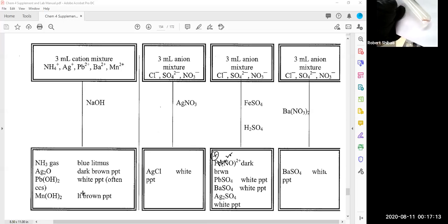Do you see it? Look at the interface between the sulfuric acid and the green solution, or above it. At that interface, there's a layer. Do you see the brown layer? Okay, this is the famous brown ring. And we couldn't see it before because that precipitate was interfering with the interface and not letting it react.